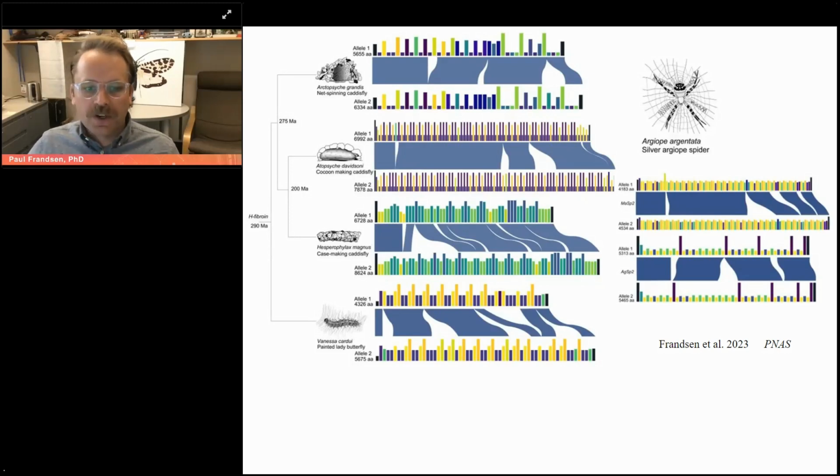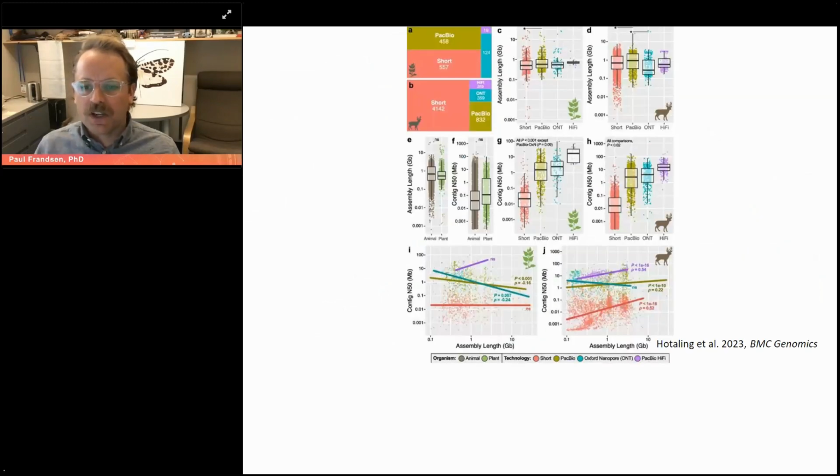And so I'll just finish up this particular section to show what effect high fidelity long read sequencing is having on biodiversity genomics, for those of us who study genomics in non-model systems, not in humans, not in Drosophila melanogaster, but in things that had never had their genome sequenced before. This is just a figure from one of our recent publications that shows that these genomes that are assembled with high fidelity long read sequences are much better.